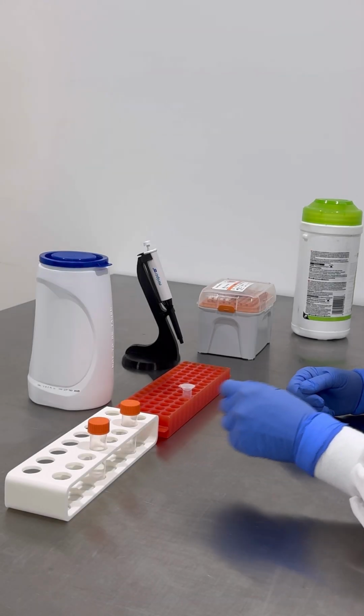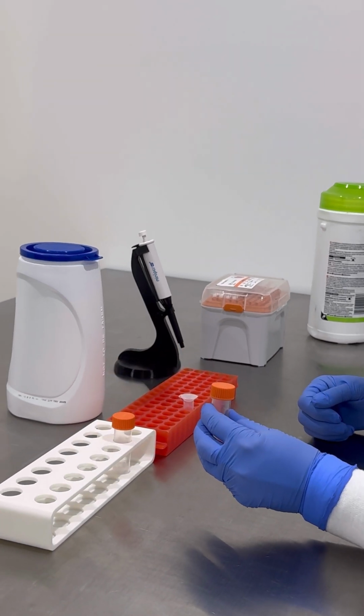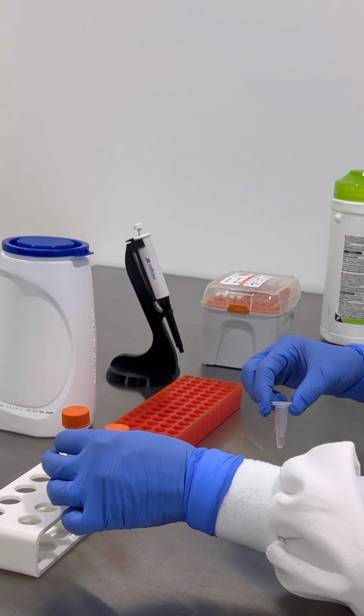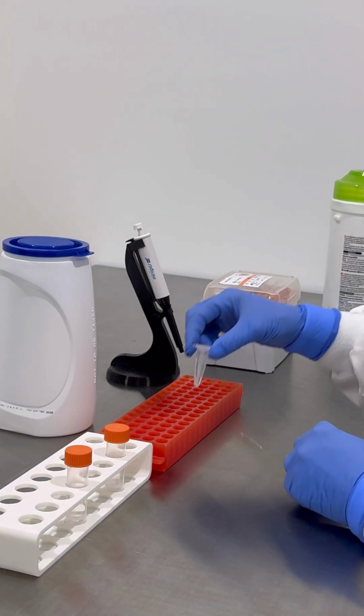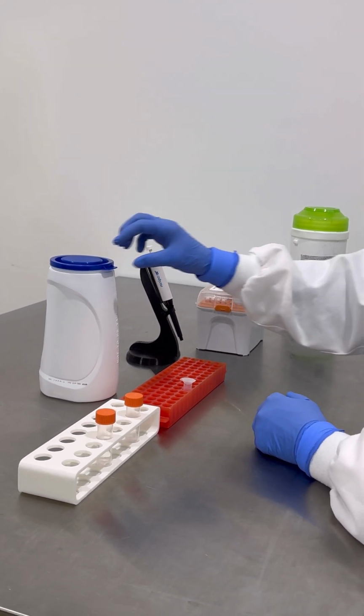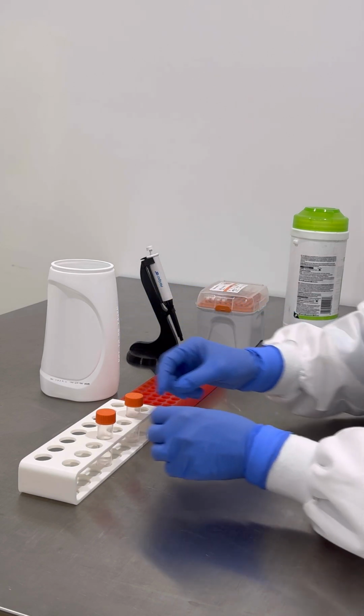Now we will use the micropipette to measure 20 microliters of liquid from a sample tube to a reagent tube. Place the sample tube into the sample rack. Place the reagent tube into the reagent rack. Remove the lid of a disposal bottle. You could use an empty milk bottle for this purpose.